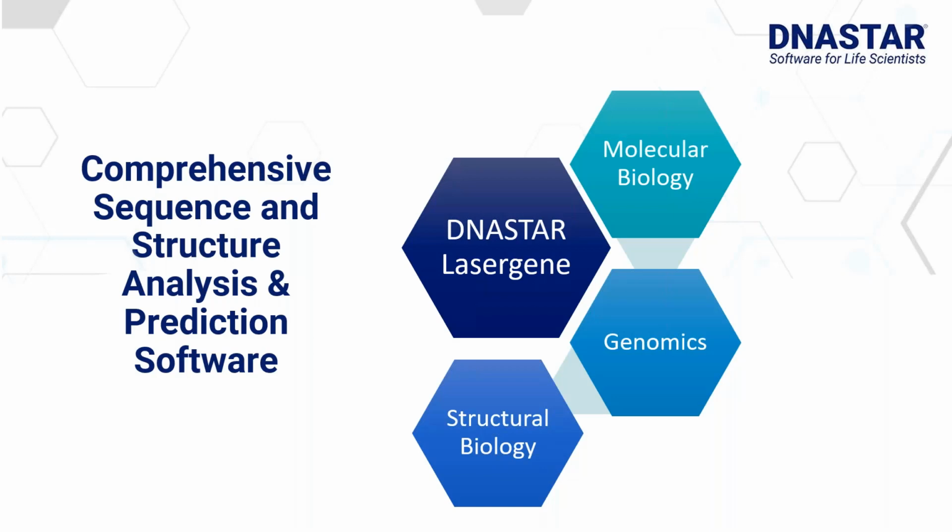And all of these areas had updates in Lasergene 17.1. Today, we're going to really focus on the molecular biology features. And then we have another webinar scheduled for August 5th, where we'll cover some of the new genomics features. And I know Matt's going to show some of those today, but just a heads up that today's going to be a pretty deep dive on the molecular biology and just a higher level overview on the genomics features.